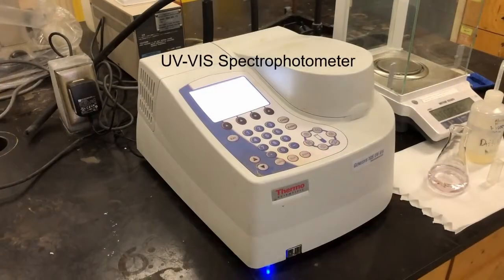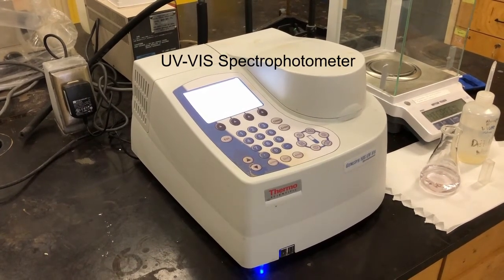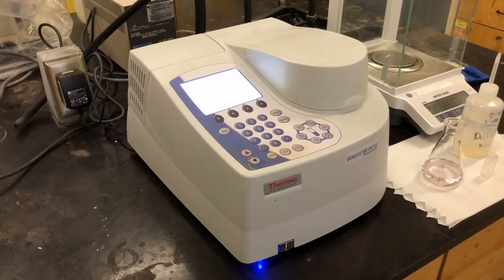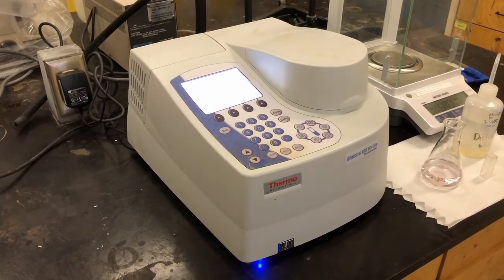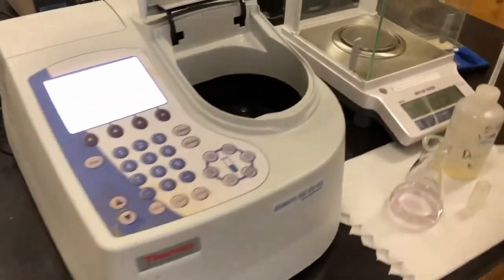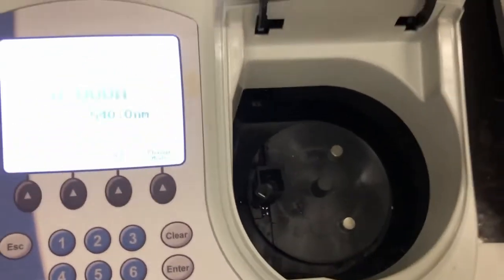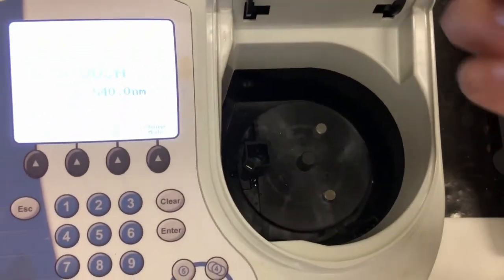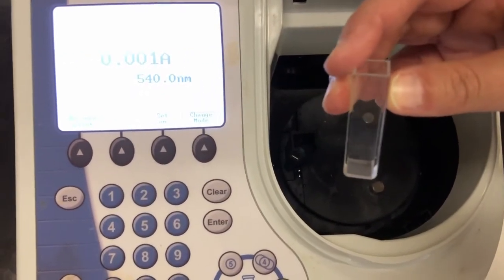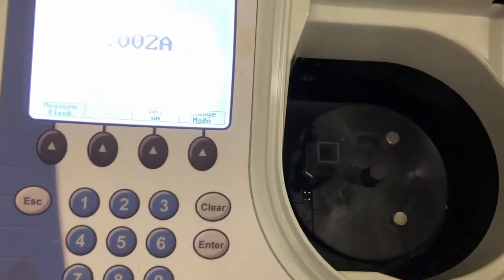Okay, so we're here at the spectrophotometer. And this is a UV-Vis spectrophotometer. What that means is that it measures wavelengths in the UV and visible range of the spectrum. If we look in the spectrophotometer here, you can see that this is where we put the sample. The sample goes in a cuvette. It's just a small square cell. We put the sample in there, and then that fits into the spectrophotometer.